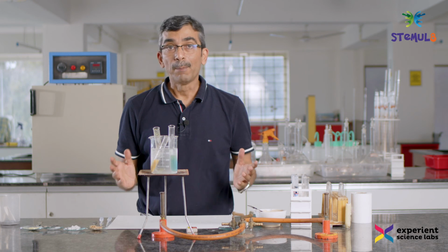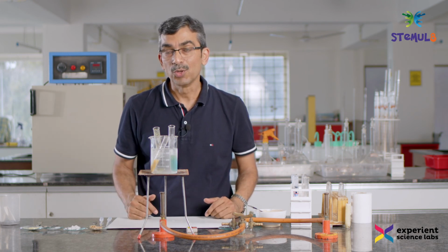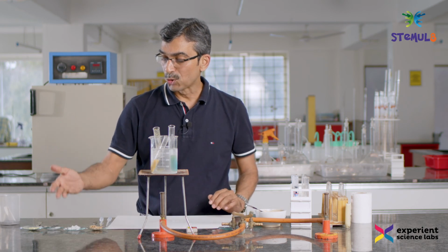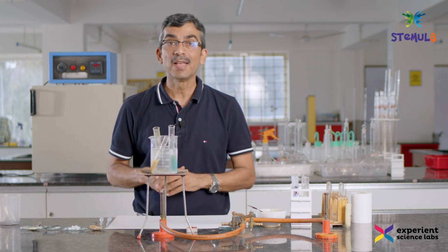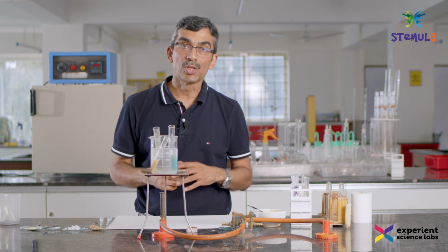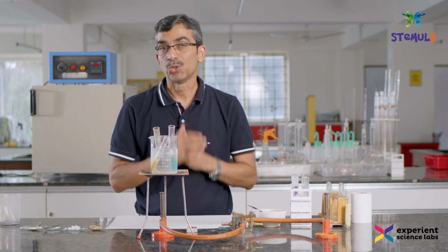With that, we complete our testing of macronutrients and micronutrients in the food that we used today: moong dal, sugar, rice, groundnut, and the fruit juices, using different reagents: DCPIP for vitamin C, biuret solution for protein, iodine for starch, and Benedict solution for sugar.